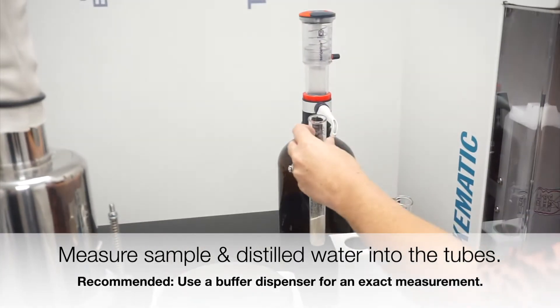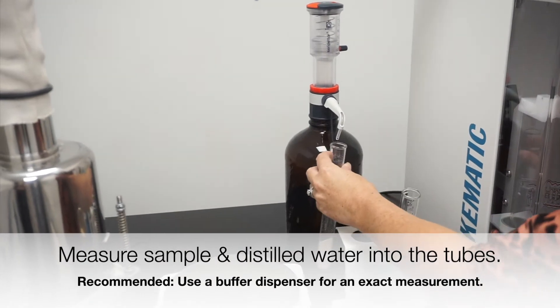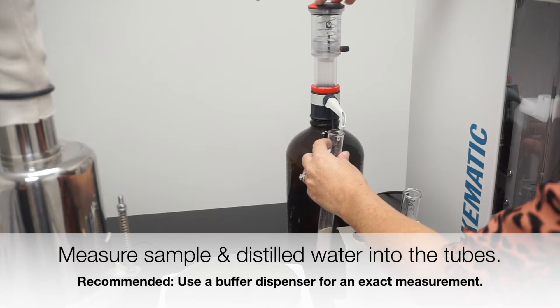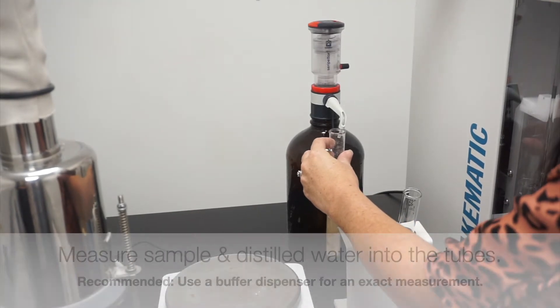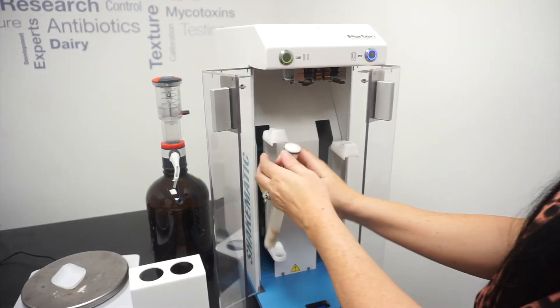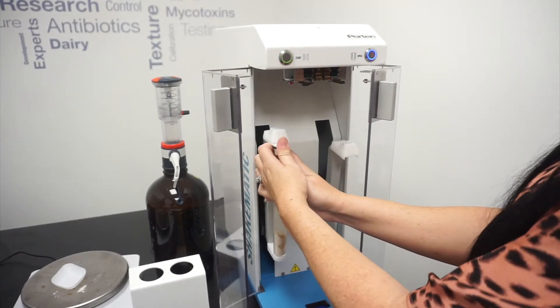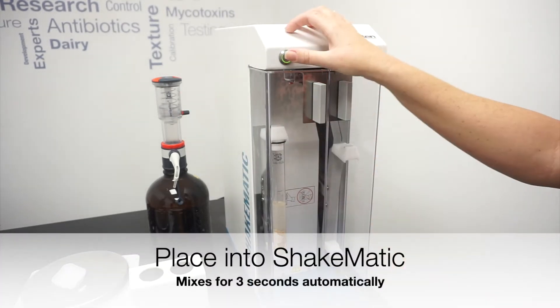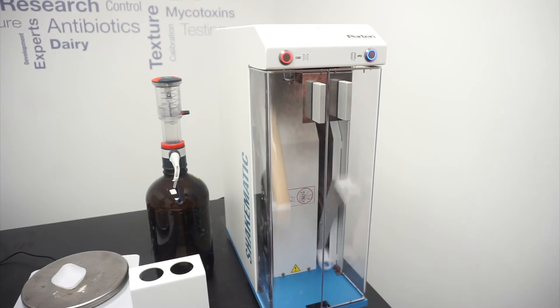Enzyme activity starts as soon as the water is added to the sample, making time of the essence. The viscometer tube is capped with a Shakematic bung and then inserted into the Shakematic unit. The bottom of the tube should be inserted first, then the top will click into place.